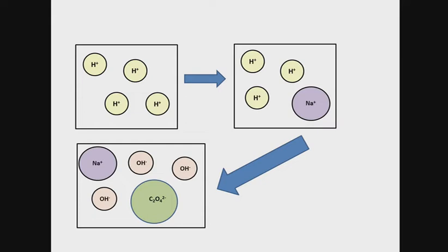And this justifies our adopted method of how we find out V alkali, that is the volume of the alkali solution that is required for the complete neutralization of the oxalic acid solution. Knowing V alkali, you can find out the strength of the supplied sodium hydroxide solution.